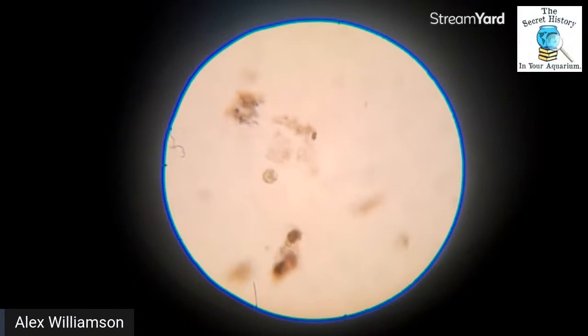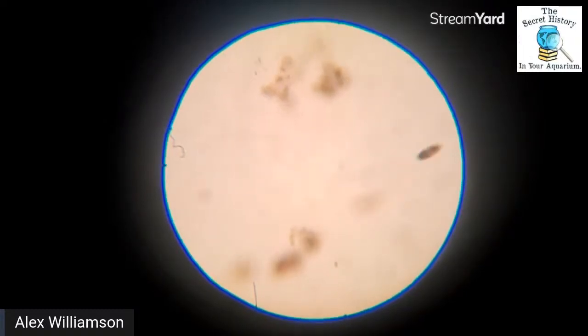Ta-da. I'll stop touching the microscope so it won't vibrate. We love these guys with the little flagellas. This is in crystal clear water. I can barely, and I'll show it to you, even see the dust that makes up these little specks in the water. Yet we've got at least three life forms in here. You can see the big egg-like one right in the dead center. He's doing something. She. Then we've got the little race cars zooming by that are large and have big flagellas, meaning they've got the hairs on them that let them swim.